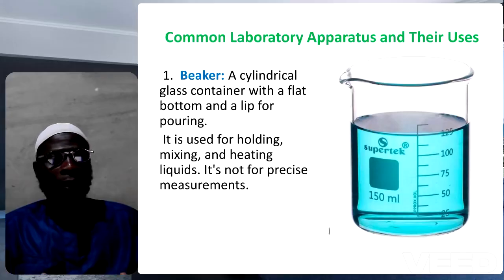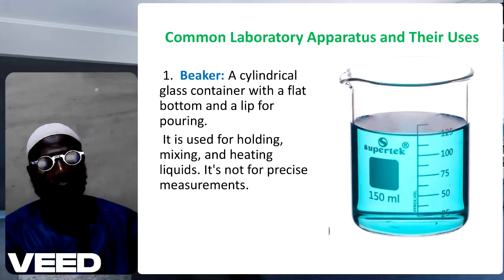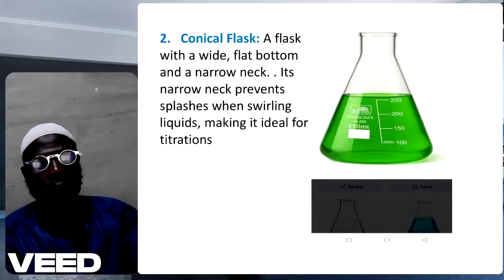So we use it to hold the chemical, or if we want to mix chemicals together, we use it to mix chemicals together. Sometimes if we want to heat, we normally use it to heat. That is the function of a beaker. It is a glass apparatus.